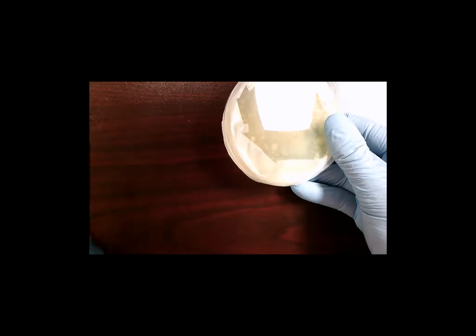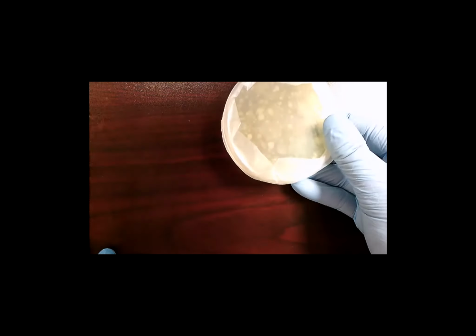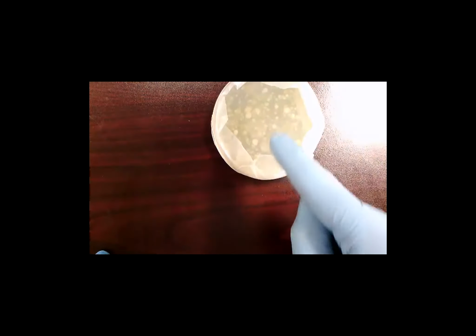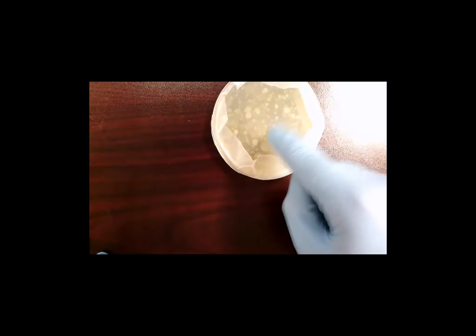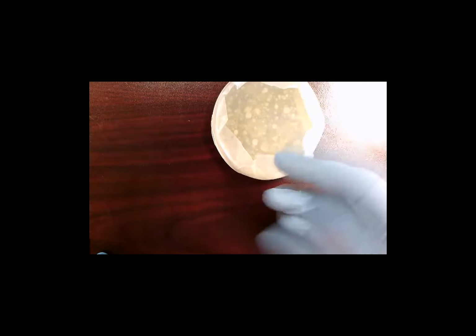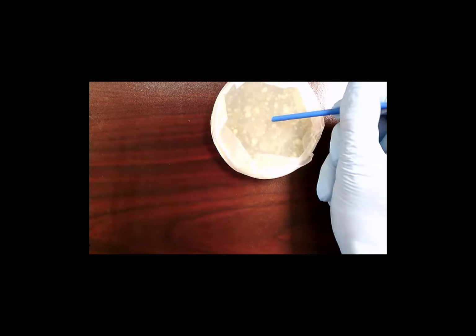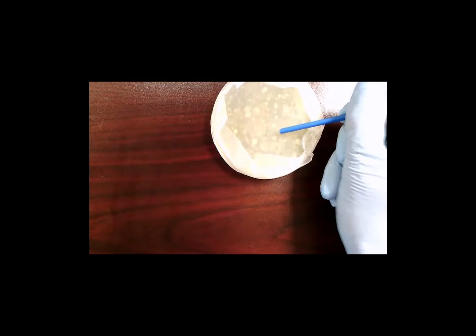And so on this, what colonies do they count? On this one, it's the general bacterial count, so everything that's a bacterial colony is counted on the nutrient agar, which is this clear agar here. So everything is a colony. There's 1, 2, 3, 4. There's tons of them on here.